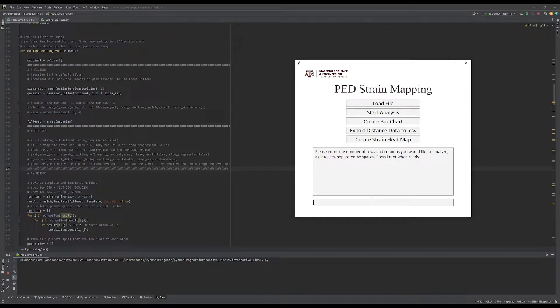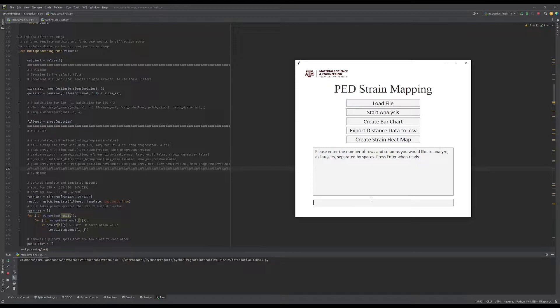Enter in the number of rows and columns of the data set you'd like to analyze. In this case, my data set has 50 rows and 50 columns.